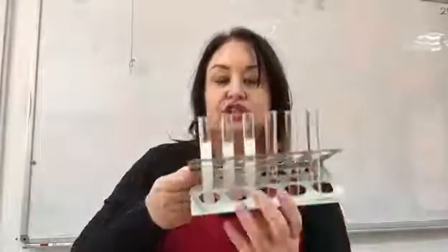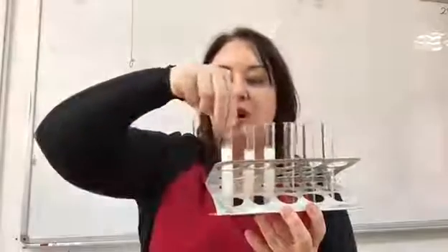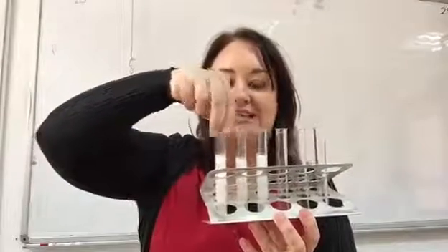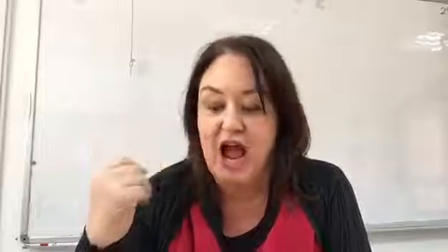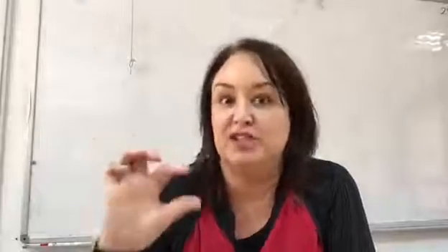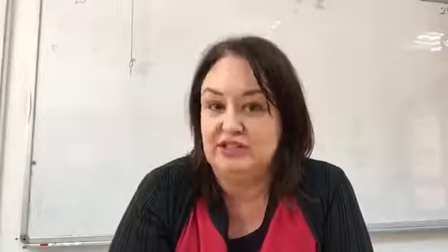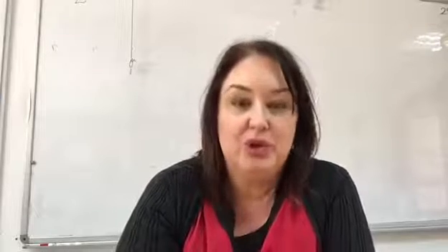We've taken our six test tubes as the instructions suggest and on three of them we've marked them with an X, about halfway up the test tube. Earlier today one of my students used boiling tubes and when she put the X on there, the solution didn't quite reach the X so she had to start again. Do make sure you've got test tubes — it's a brilliant mistake because it's the kind of thing you'll record in your lab book.